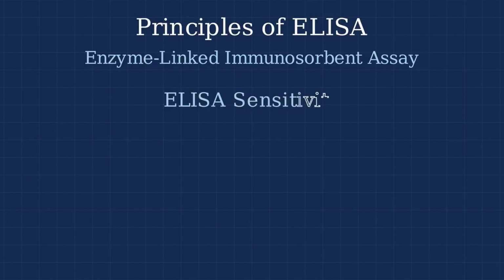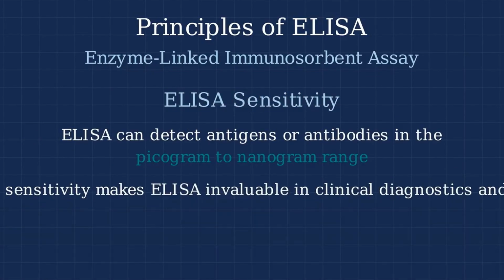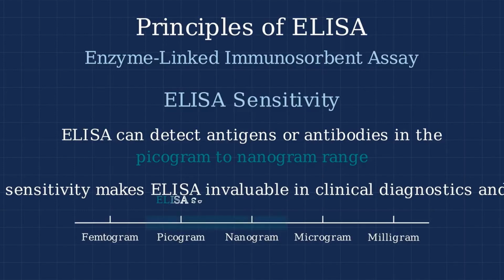ELISA is characterized by its exceptional sensitivity. This high sensitivity makes ELISA invaluable in clinical diagnostics and research applications. ELISA can detect molecules at concentrations as low as picograms per milliliter, making it one of the most sensitive immunoassay techniques available.